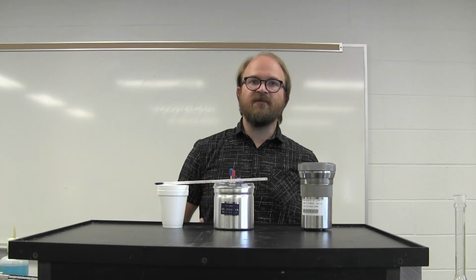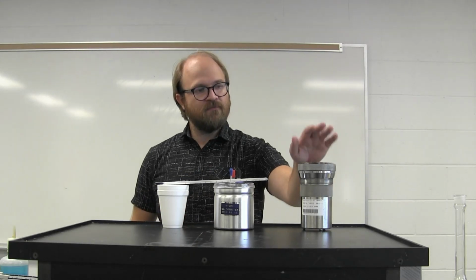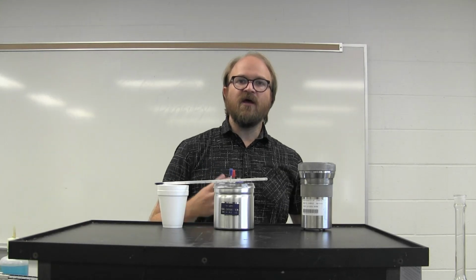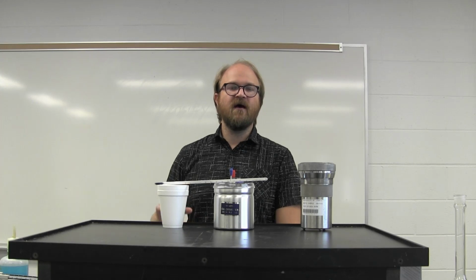This is theoretical, and really in all calorimeters, even things like a bomb calorimeter, there would be over time some heat exchange with the surroundings. But as you're doing it in a simulation, you're going to look through these couple of different processes. You're going to measure the heat associated with them and look at the molar heat capacities, or the molar energies associated with those different processes.